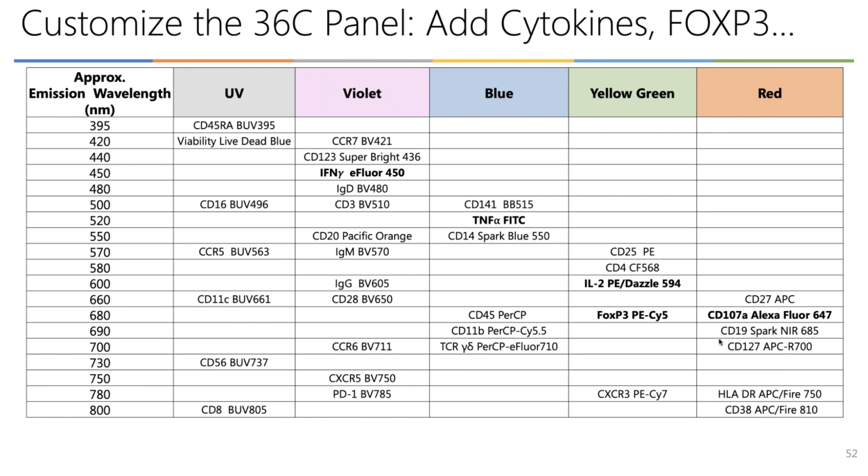Here is an example of somebody who came to me and said, Maria, I need cytokines in that beautiful panel. Okay, no problem. Let's work together. Let's swap some markers. Let's make sure we use the best possible dyes for the cytokines. I love to use dyes that are small molecule that will give me little background. And let's make sure that we make the best possible decisions together in terms of panel design to incorporate that.